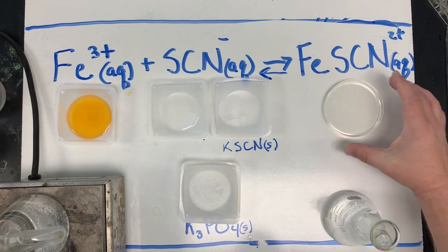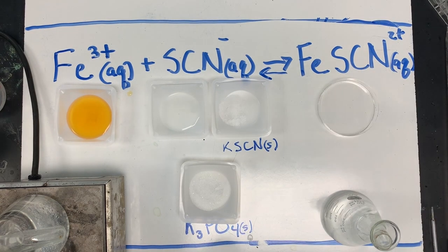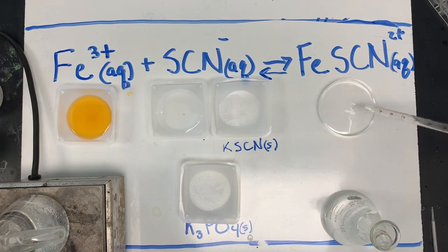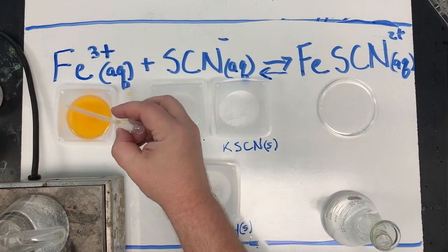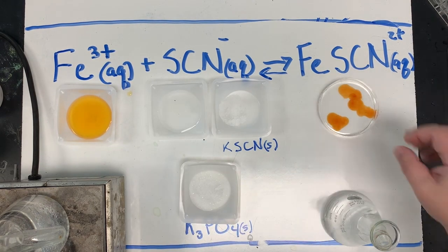Okay, I'm going to go ahead and put this in the waste. And we'll go back to our original solution. Add a little more of my thiocyanate. And then we'll do 10 milliliters here. And then I'm going to take and add a few drops of the iron. And we'll swirl this up.